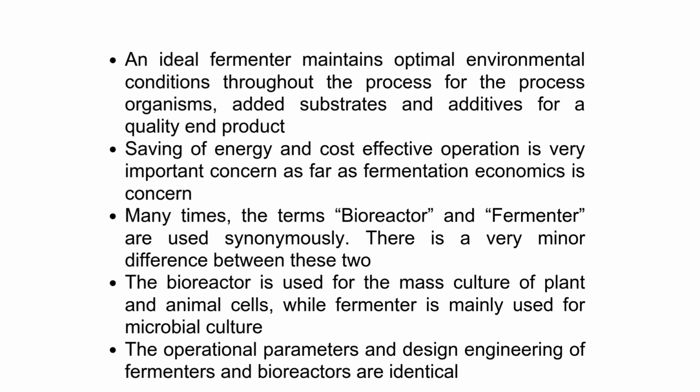An ideal fermenter maintains optimal conditions throughout the entire process for the organisms, substrates, and additives, ensuring a quality end product. Saving energy and operating in a cost-effective way is very important for fermentation economics.